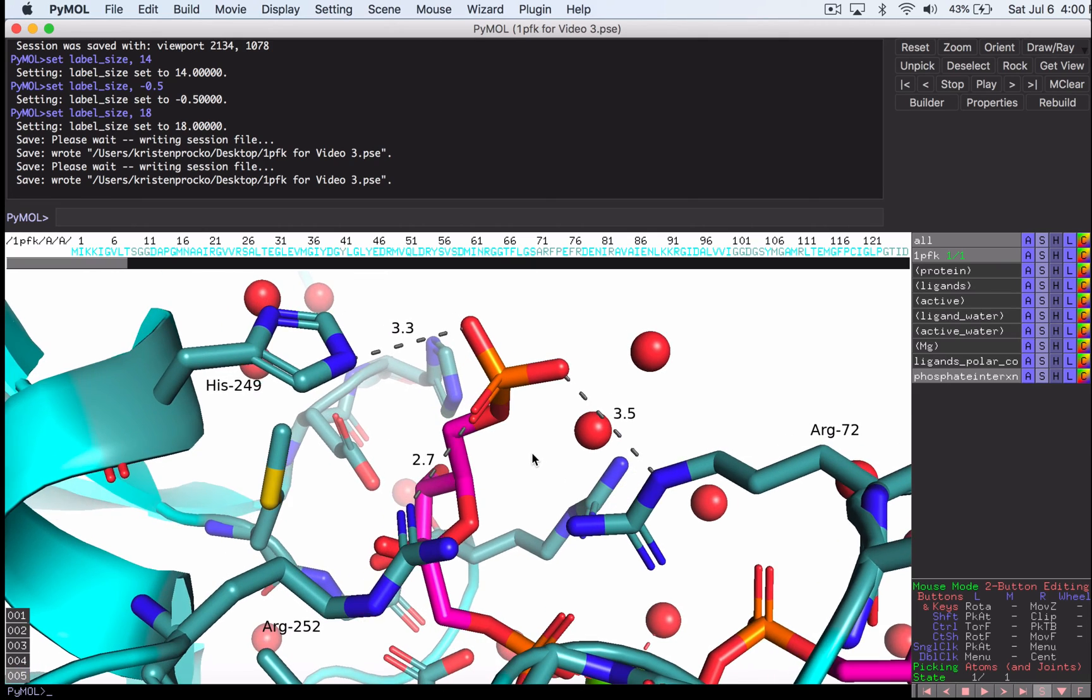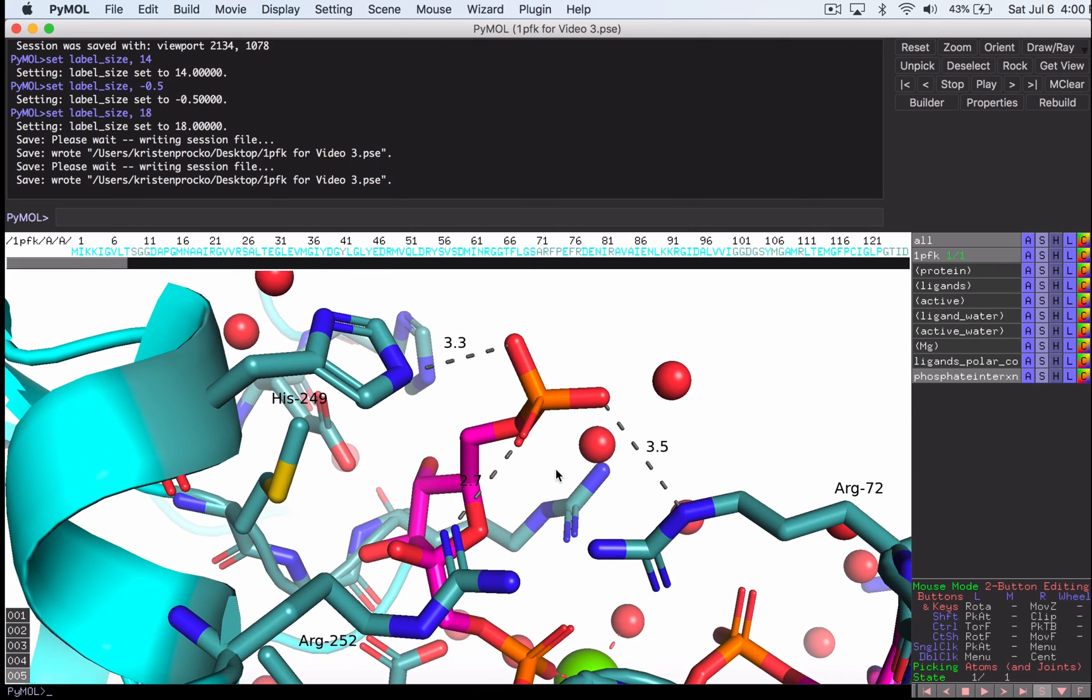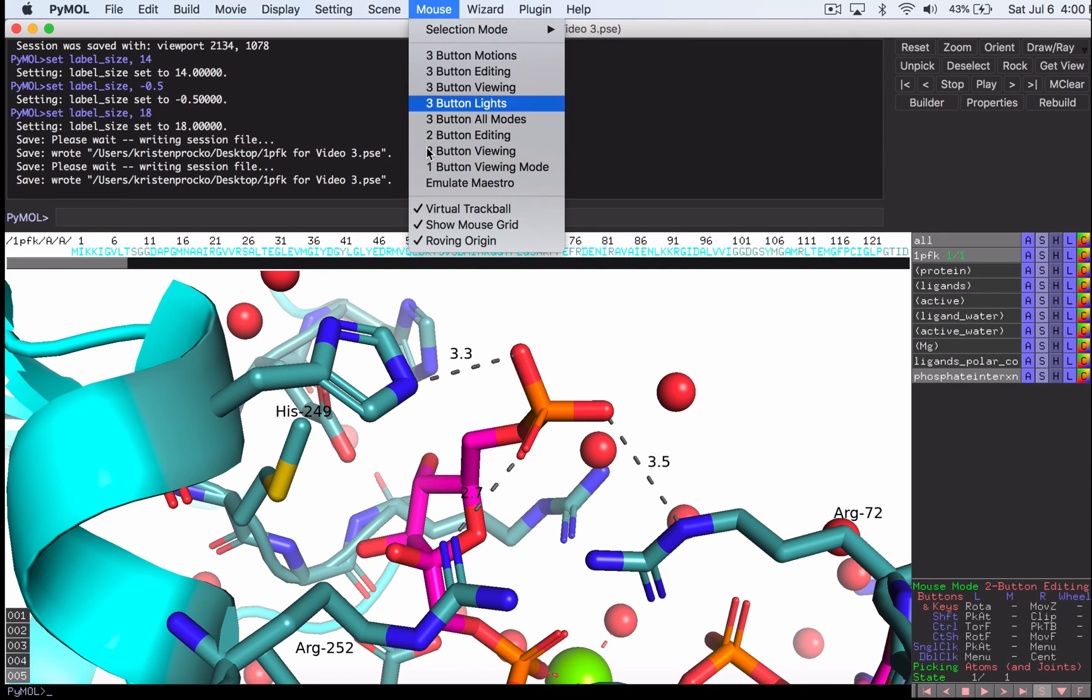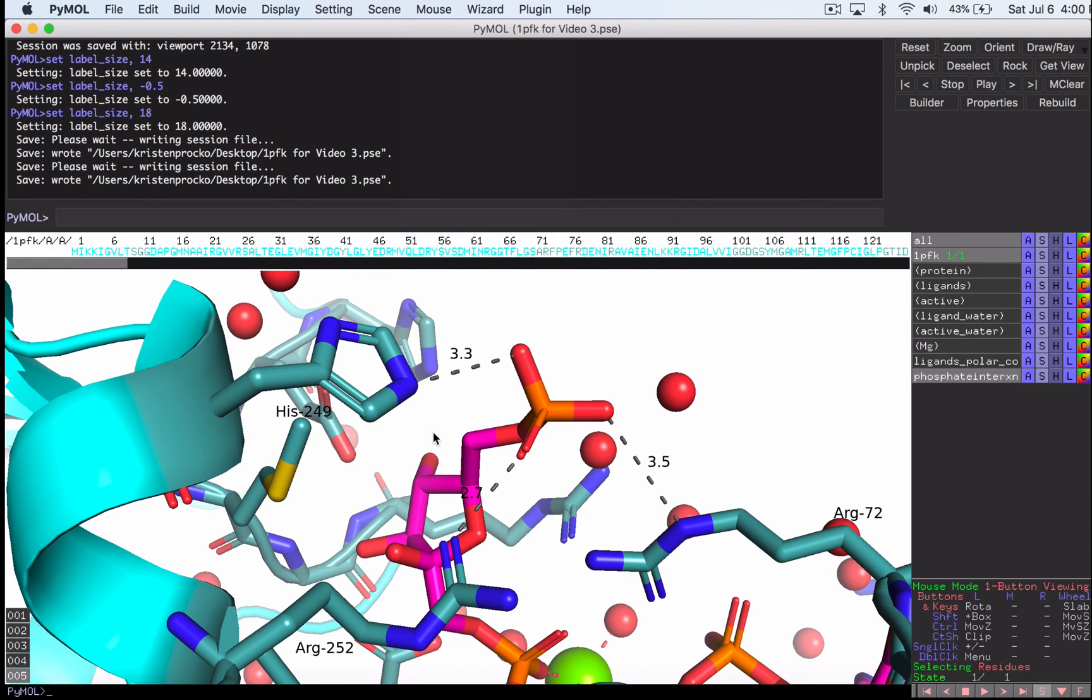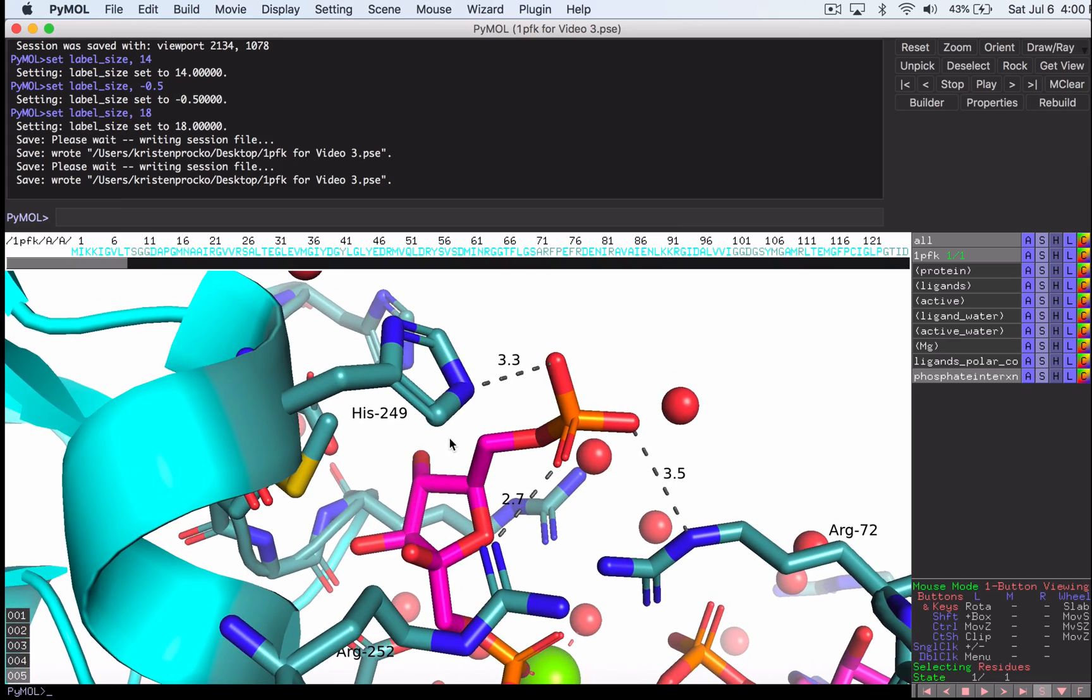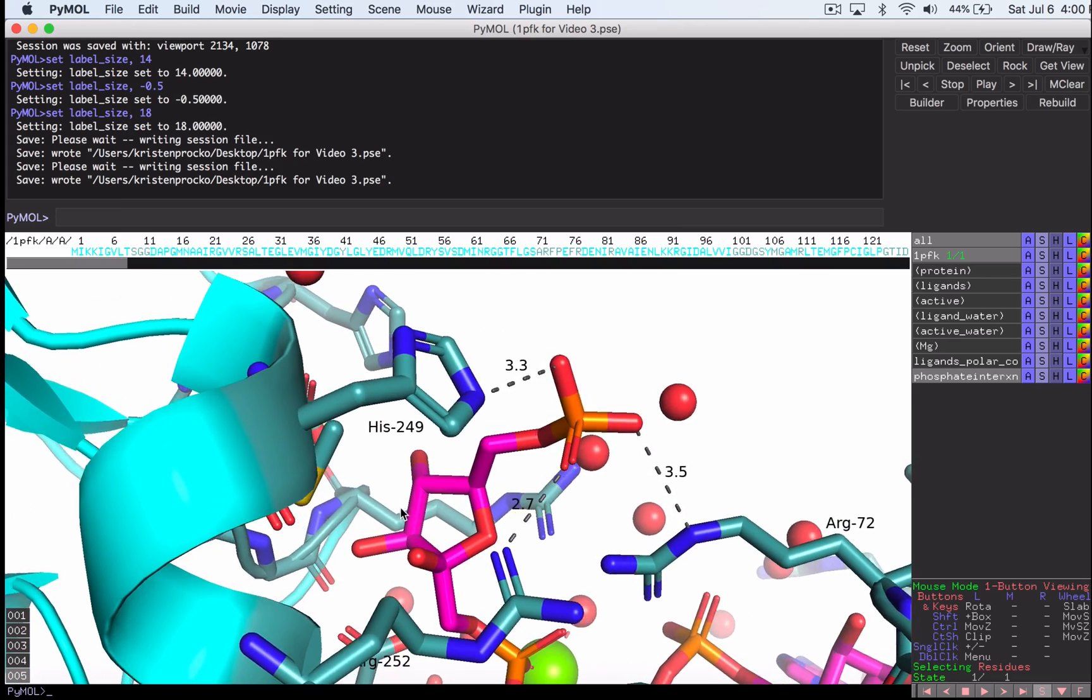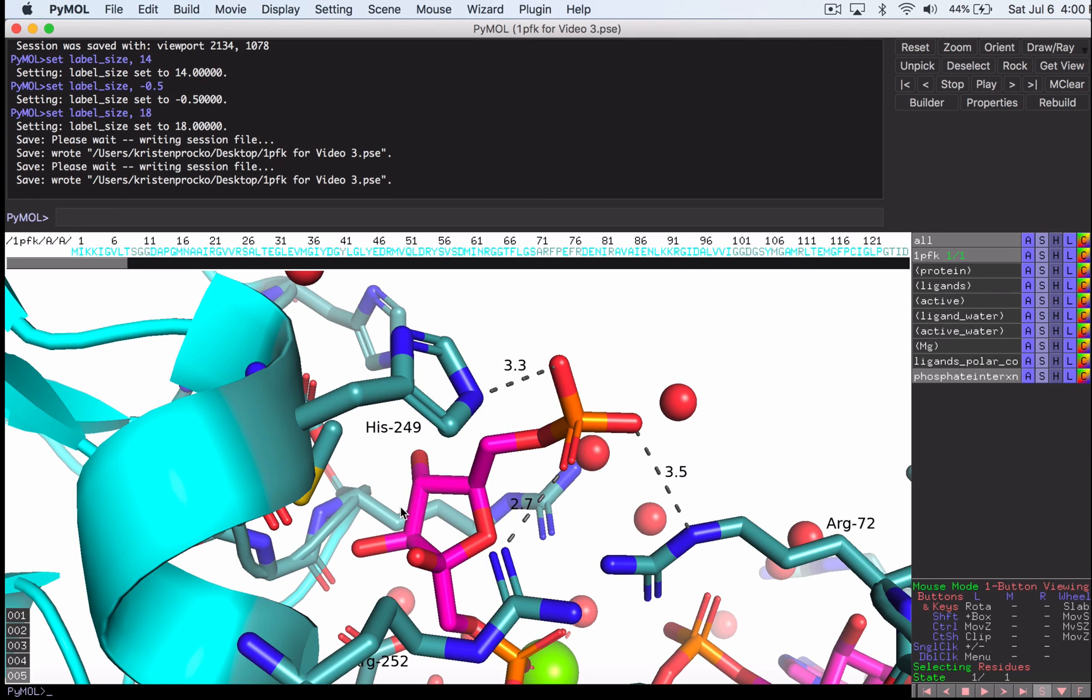Okay, I'm not nuts about the orientation because I can't see my sugar very well. So I may need to move things around again and actually right now, let's just exit, go back to one button viewing mode just so I don't have an accident in that edit mode. But I'm going to orient this as best I can to show these interactions. Oh, I like that. That looks pretty good. My sugar isn't too obscure. This phosphate's kind of overlapped, but you know, just minimizing overlap is really great.